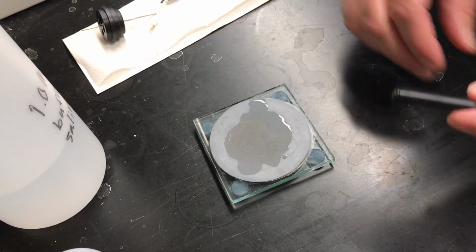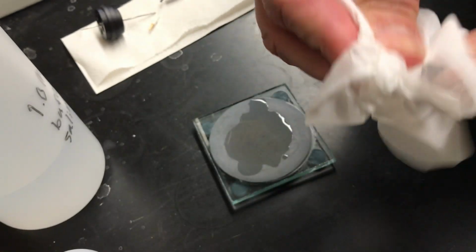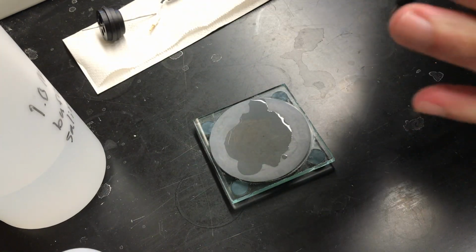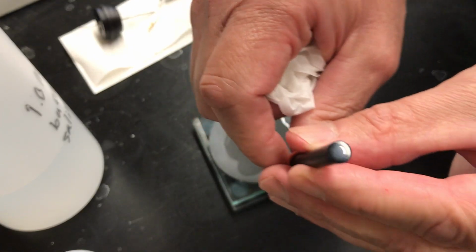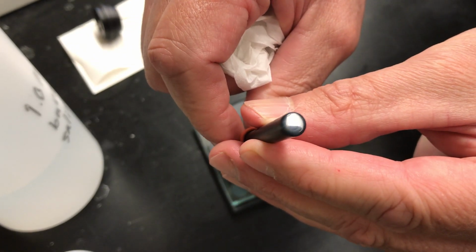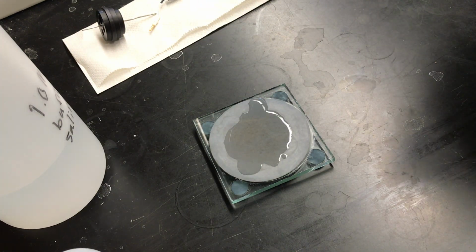Okay, once that's done, I can come back with a Kim wipe and wipe down the surface of the electrode and take a look at it. And it should be mirror polished at this point. You probably can't see it, but it has sort of a mirror polished finish to it. Okay, so I know now that the electrode is clean.